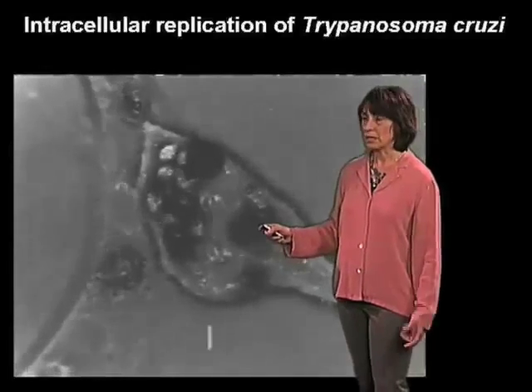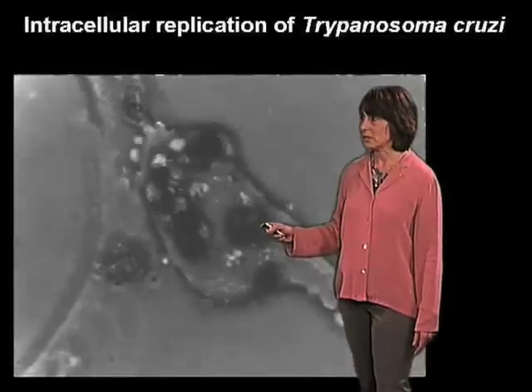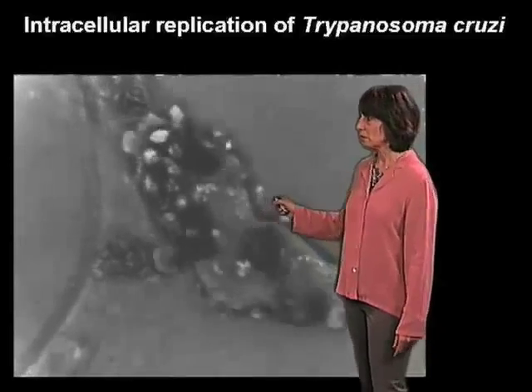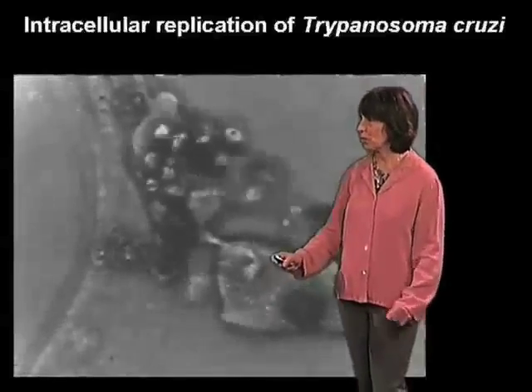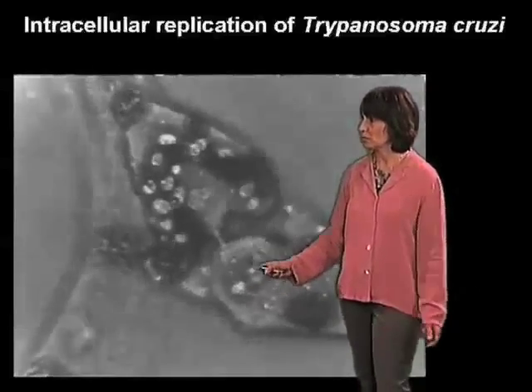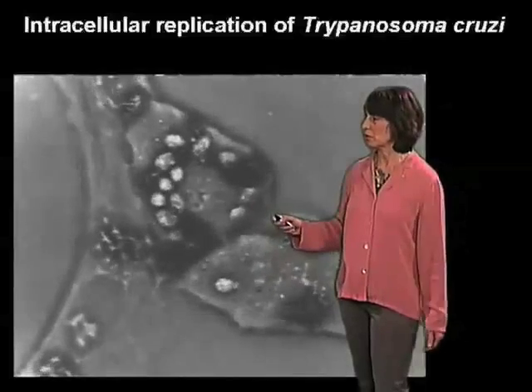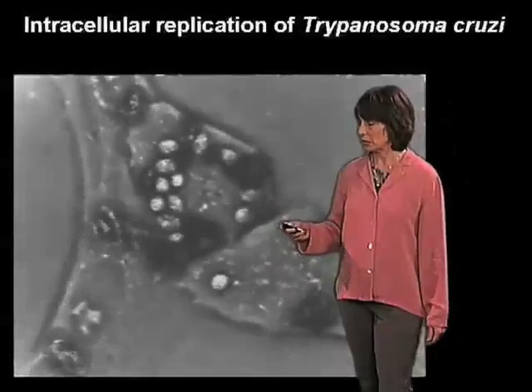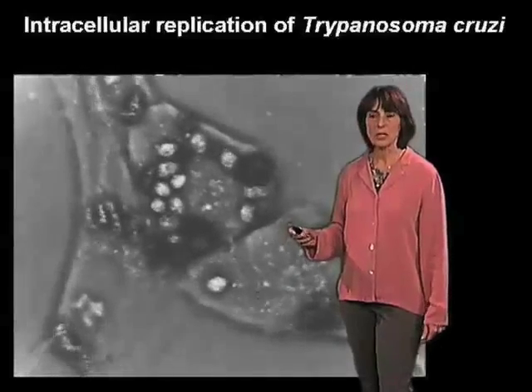Then the cell rapidly enters cytokinesis. If we focus on these cytoplasmic parasites, it's possible to see that one of them was actually delivered to one of the daughter cells while the majority remained in the other cell. So this cycle continues.